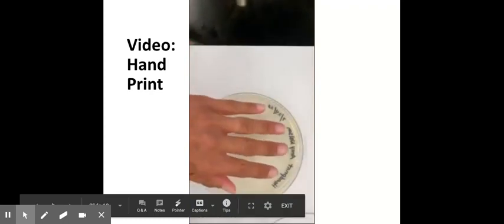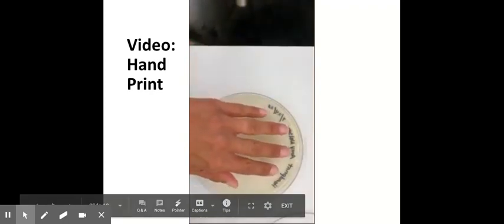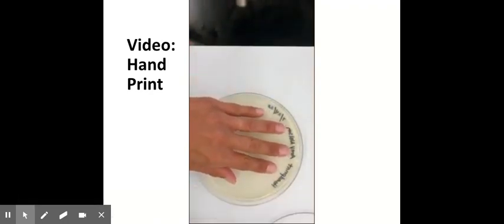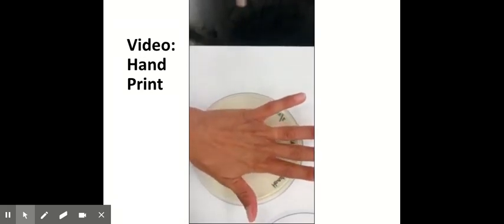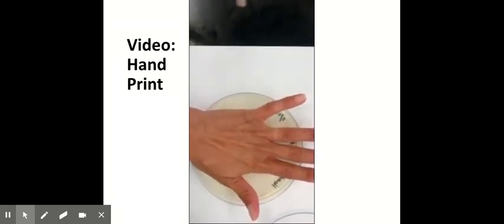So you would open the plate, press your fingers onto the plate, onto the agar, and then gently lift up and then press your palm onto the agar.